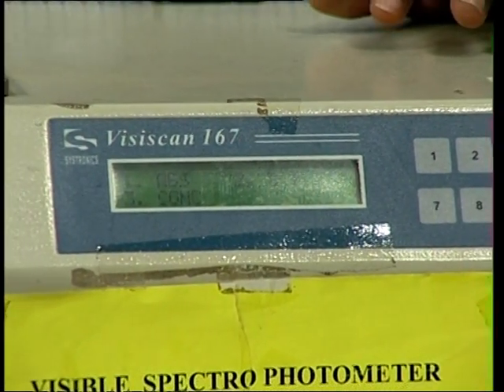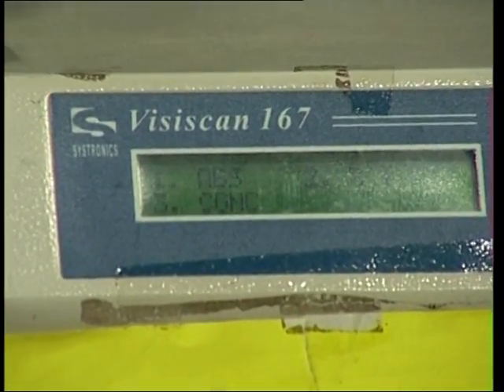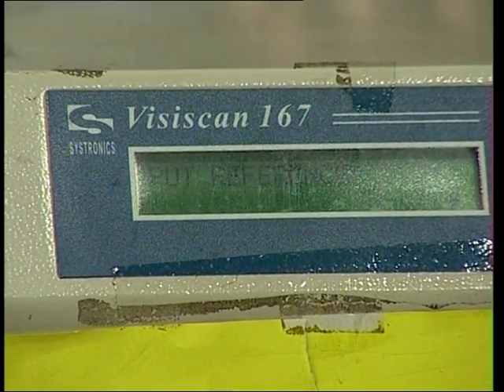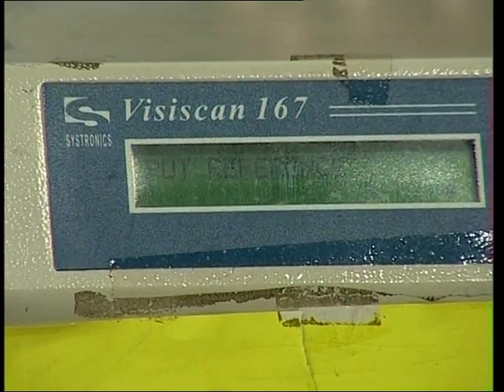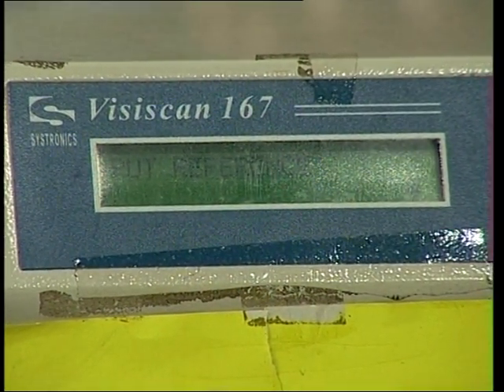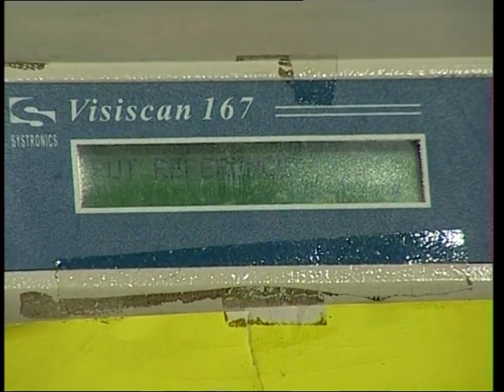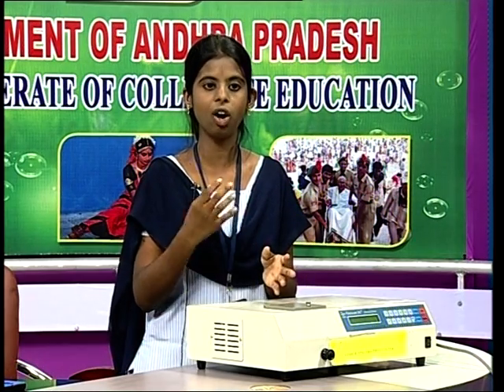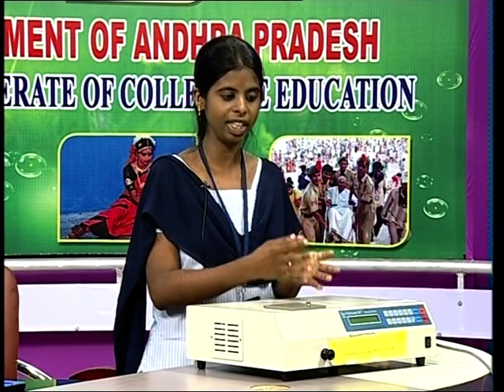Here the sample solution which we are keeping is to detect how much concentration, or the type of concentration, this solution holds. When the light is passed to the sample holders, only a few of the substances present in the sample holders absorb this radiation, whereas the non-absorbing substances transmit this wavelength into the detectors, which is detected by the detectors, and the reading is given out by the ammeters or potentiometers or potentiometric detectors.